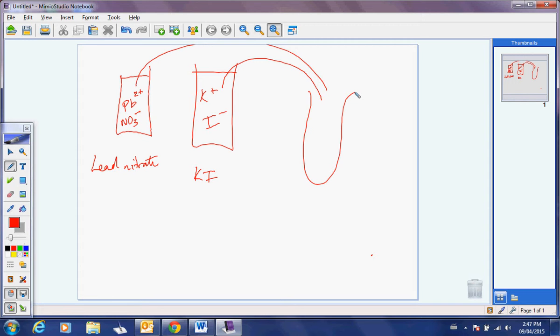Now I'm going to put them together. So two clear colorless liquids, put them together, and what do I get? I swear I saw some yellow. Cloudy yellow liquid. Right. Okay. What I've formed is a precipitate. I've formed a solid. Sometimes you can get some that's just stuck. Can you see now it's solid on the top? So a yellow solid has formed.